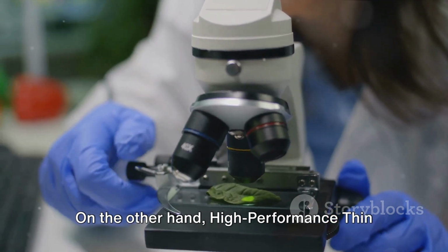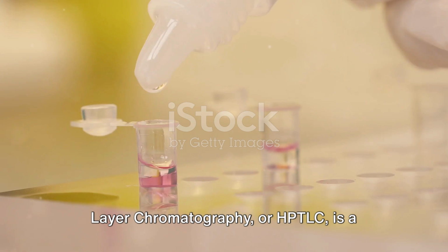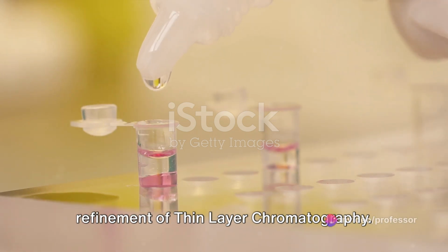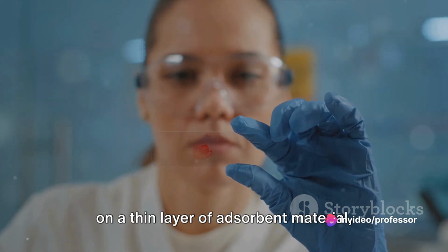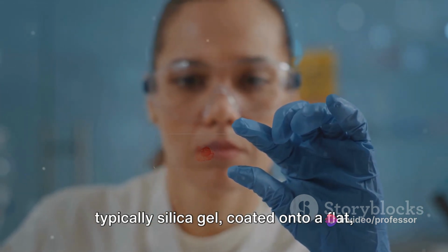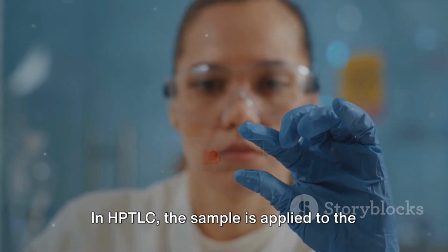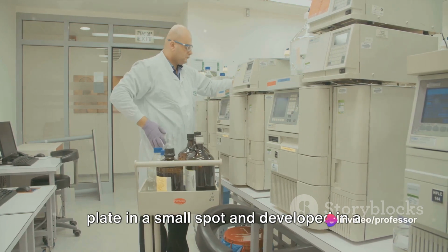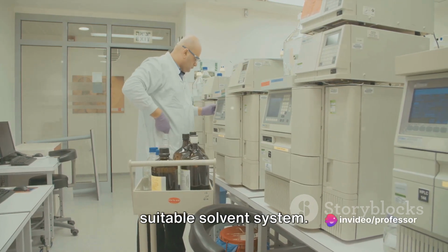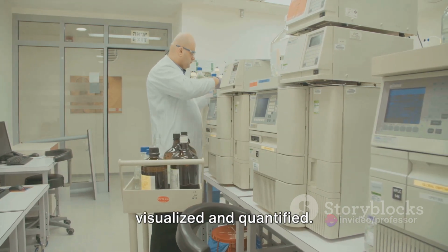On the other hand, high-performance thin-layer chromatography, or HPTLC, is a refinement of thin-layer chromatography. It involves the separation of compounds on a thin layer of adsorbent material, typically silica gel, coated onto a flat, inert carrier material. In HPTLC, the sample is applied to the plate in a small spot and developed in a suitable solvent system. The separated compounds can then be visualized and quantified.